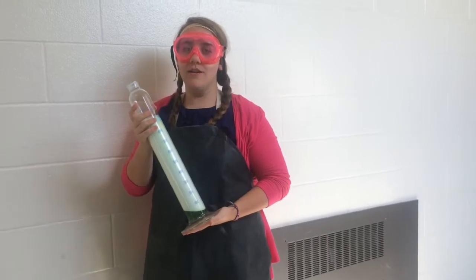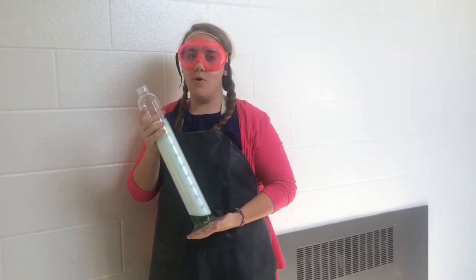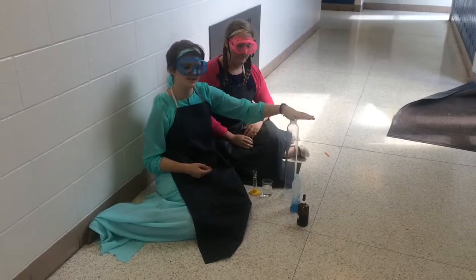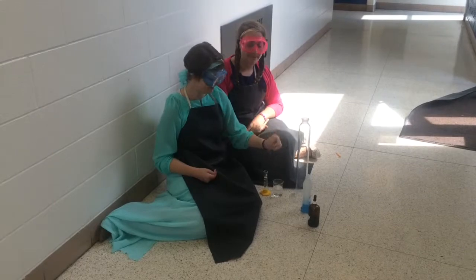Alright. In this myth, we are trying to determine if yeast will react with hydrogen peroxide the same way that hydrogen peroxide reacts with potassium iodide. Alright, so to get started with our experiment, you're going to make sure you have a clean graduated cylinder. This one measures 1 liter.